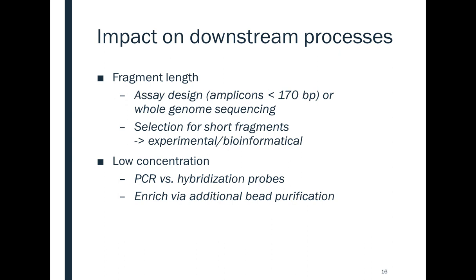With such limited material, you do not have unlimited attempts to get to the result. The analysis strategy should be based on low amounts of input DNA. I personally prefer PCR enrichments over hybridization methods because they are more specific and you only need low amounts of DNA. But it has been shown that some hybridization strategies also work on cell-free DNA.